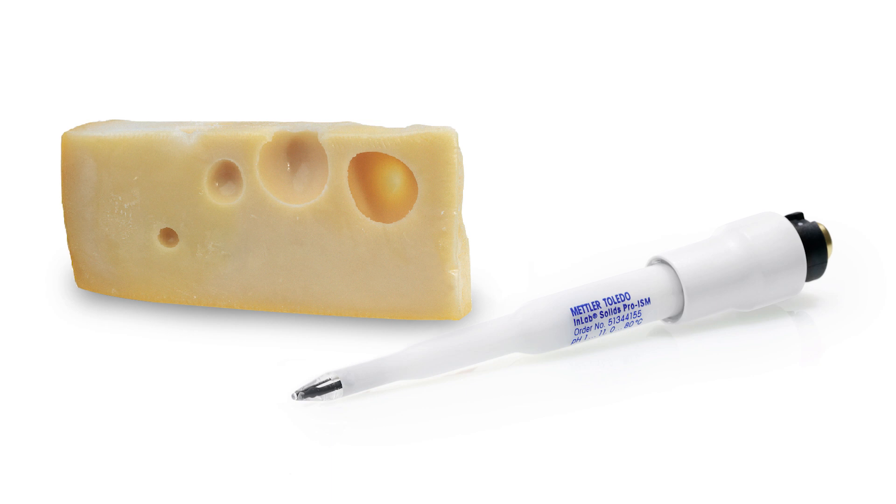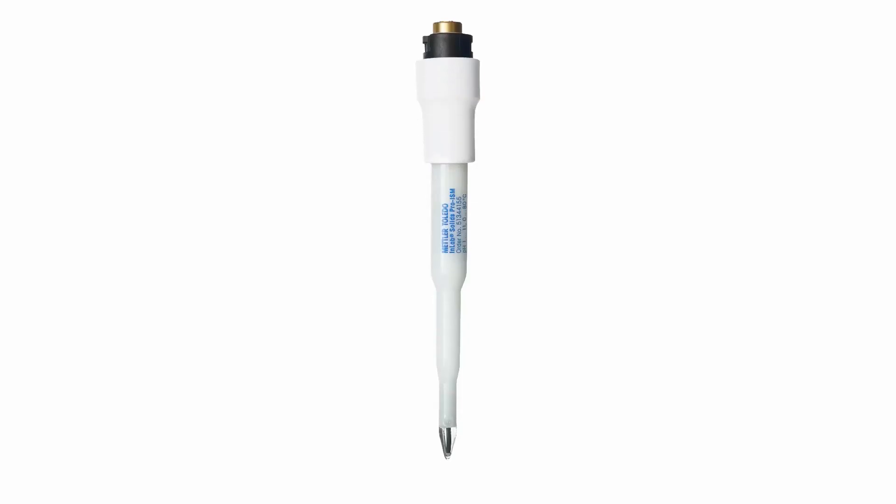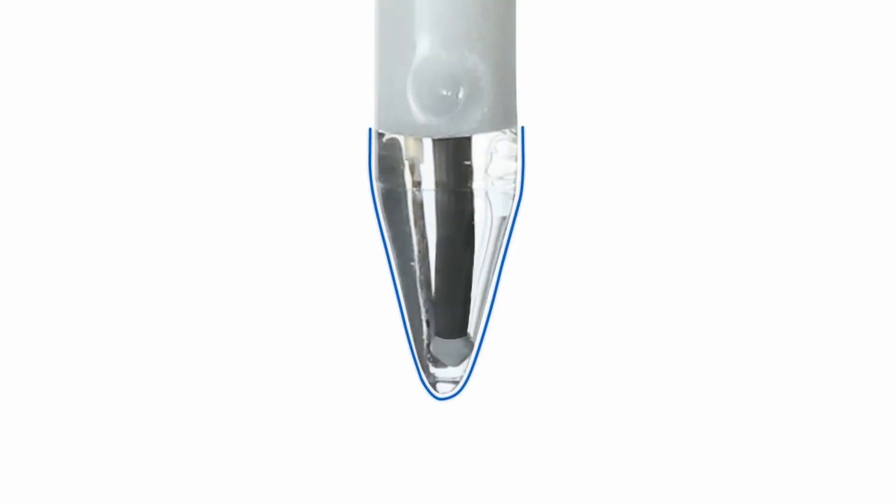Mettler Toledo offers a specialist electrode, In-Lab Solids Pro ISM, for the pH measurement of cheese samples. The electrode is low maintenance and delivers desirable performance. This electrode has a spear-shaped tip made of thick toughened glass that allows direct insertion into solid cheese samples.